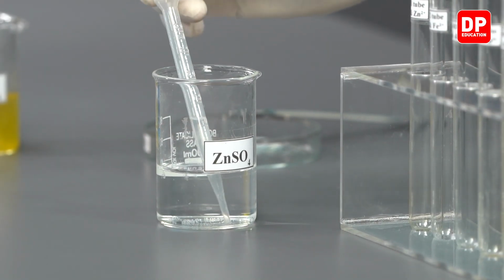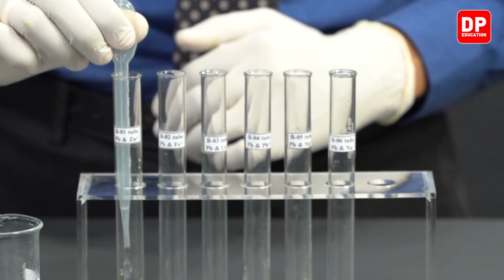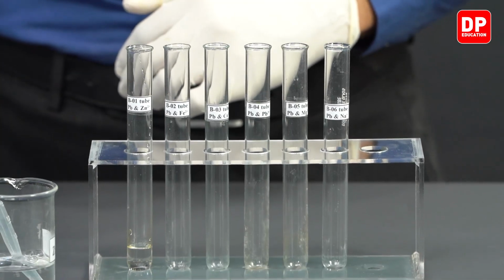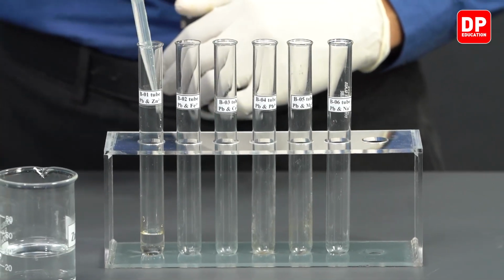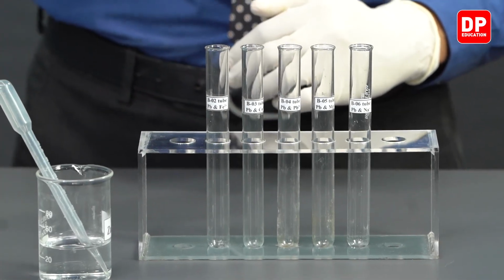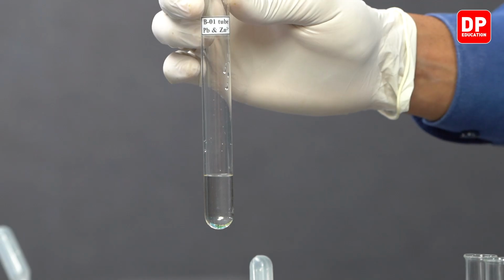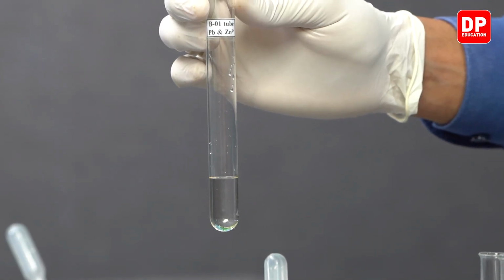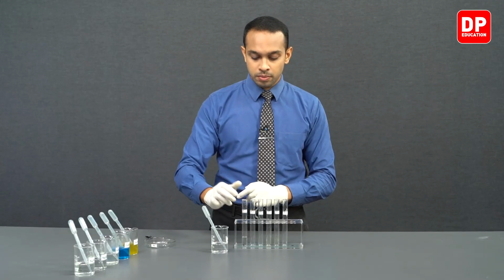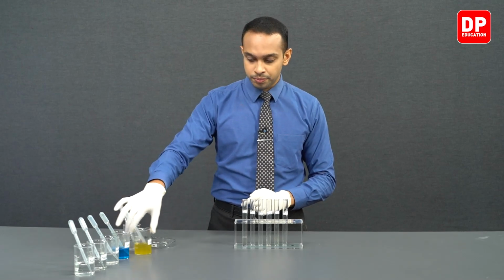So for the first test tube, we will take around 5 milliliters of zinc sulfate solution. You can see to the Zn2+ labeled test tube, we have taken zinc sulfate solution, and we will repeat the process with other test tubes as well.